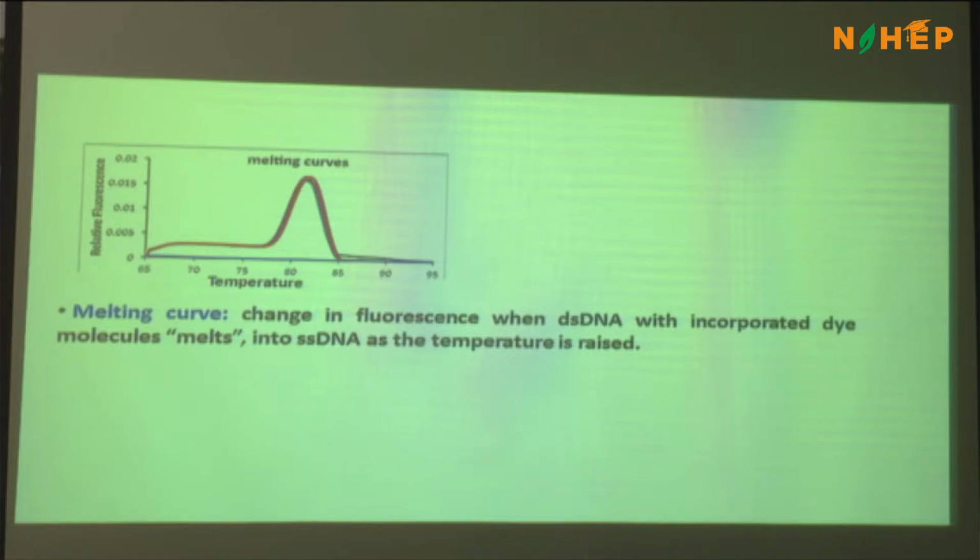To gain confidence in your data, you have to provide this melt curve image whenever you are going for a research publication from your work. Without melt curve data, we cannot say that your qPCR targeting a specific gene is very specific for that particular biological question or whatever experiments you are doing. Okay?